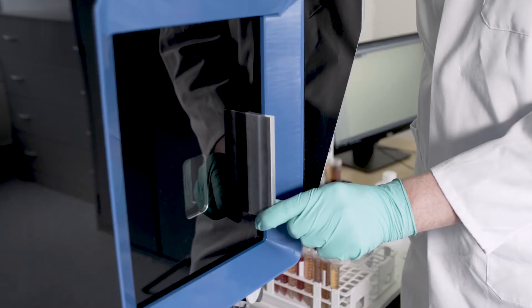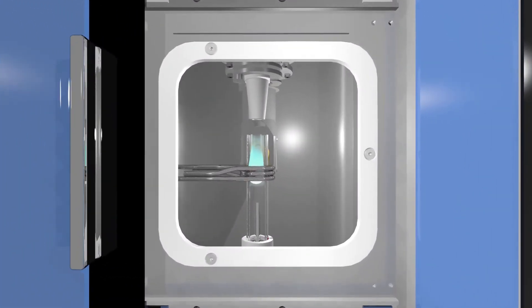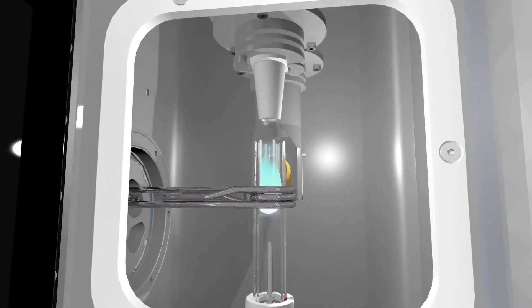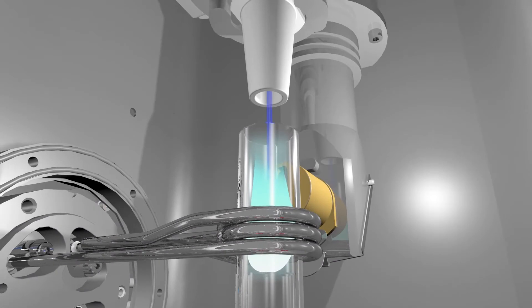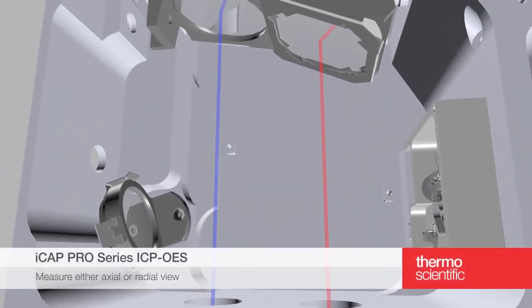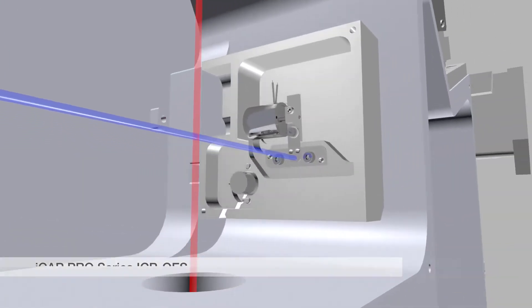The iCAP Pro Series ICP-OES enables scientists to easily overcome their trace elemental challenges to deliver accurate high-speed results. The powerful new ICP-OES platform is a significant advancement in trace elemental analysis with a fast startup time from just five minutes.